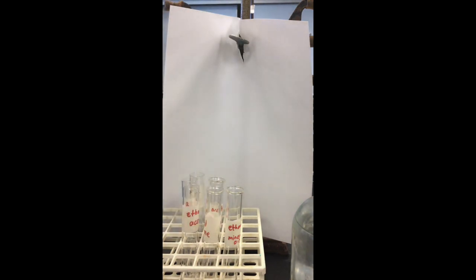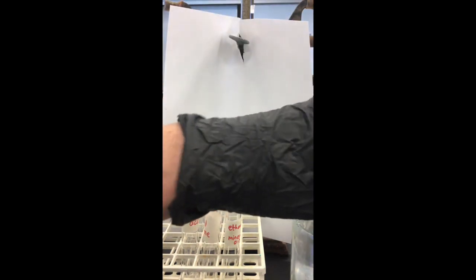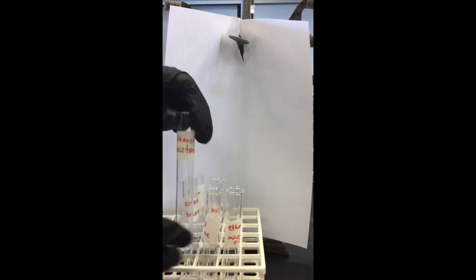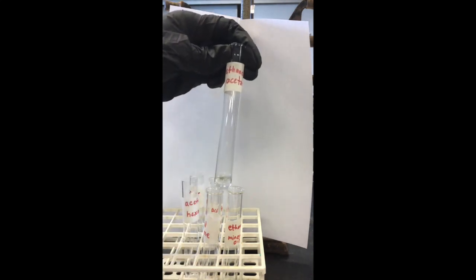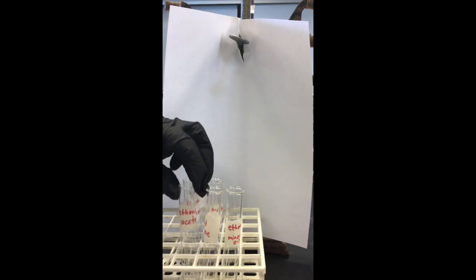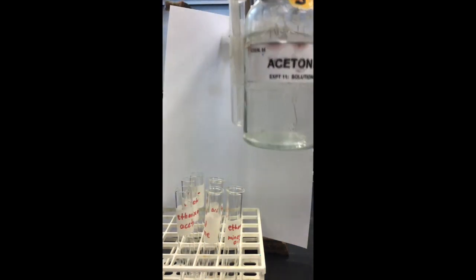And if you're not sure on some, you can always mix them and then let them sit and come back to them later, since they'll all be labeled, and determine if it formed 2 layers or not. The next sample we have is ethanol and acetone. So for the ethanol series, I've already put those in here as well. So we need to add our acetone to that one.